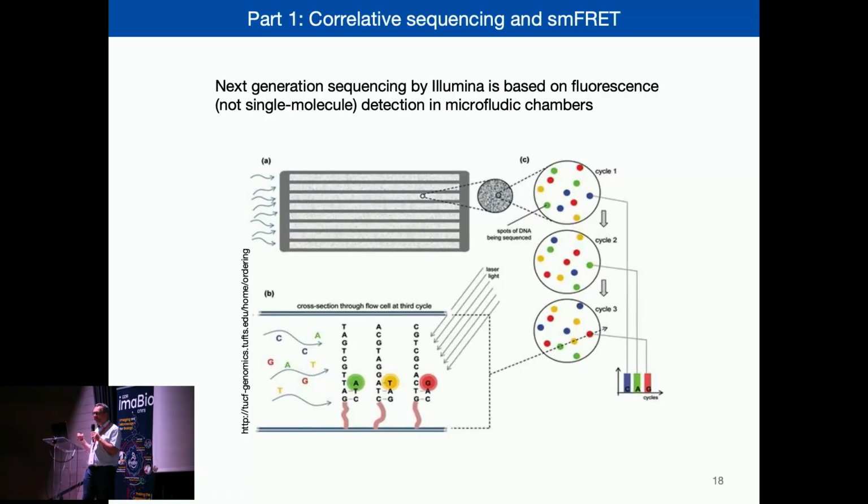So how do you transfer that to a single molecule technology? Over the next 2 slides, I will briefly explain that and give you an idea of it.